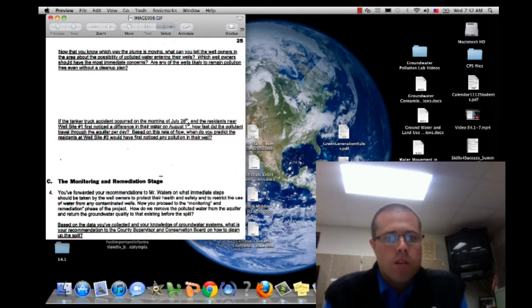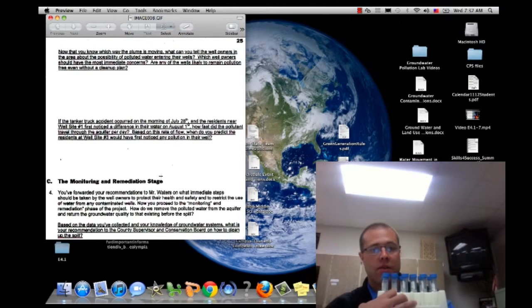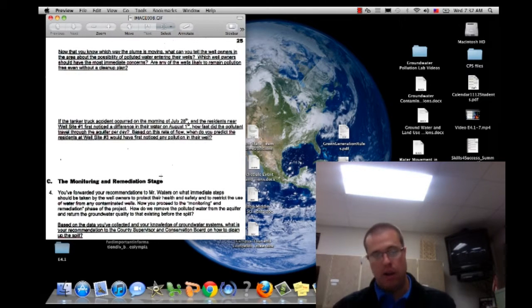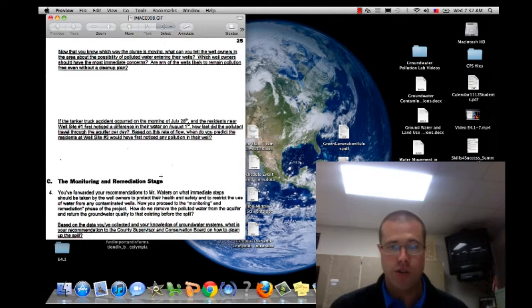So the keys to this lab: make sure each pipette stays in each well site. Do not mix them, so you're only taking one out at a time. Fill it, put the pipette back, then grab the next one, just so we're sure we're not mixing them and putting them in the wrong wells. Once you're done with that, and your spot plates are full, flag me down. I'll add the reagent. You'll be able to observe it, fill out the data table, and answer these questions.